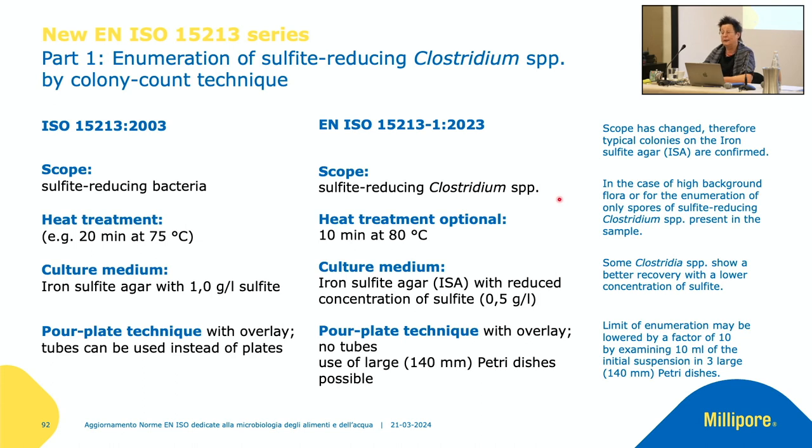But there was a request to implement a confirmation step for the Clostridia. And it was also a request from the user labs to specify better the heat treatment. This heat treatment is optional and is now clearly defined and described. The culture media has also changed a little bit. It is the iron sulfite agar, but with a reduced sulfite. So it is slightly modified.